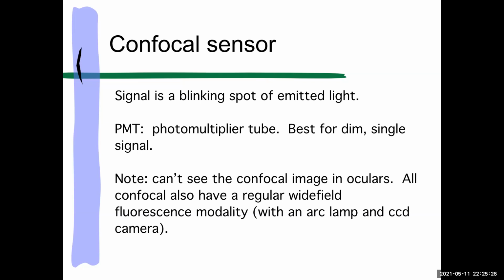The scopes also won't let you see it because with early confocals there were big issues with the lasers bouncing around the room and possibly blinding people. So there's a lot of safety built in around having a very powerful laser that you're using and directing to just one spot, one part of the specimen. You can absolutely fry tissues.